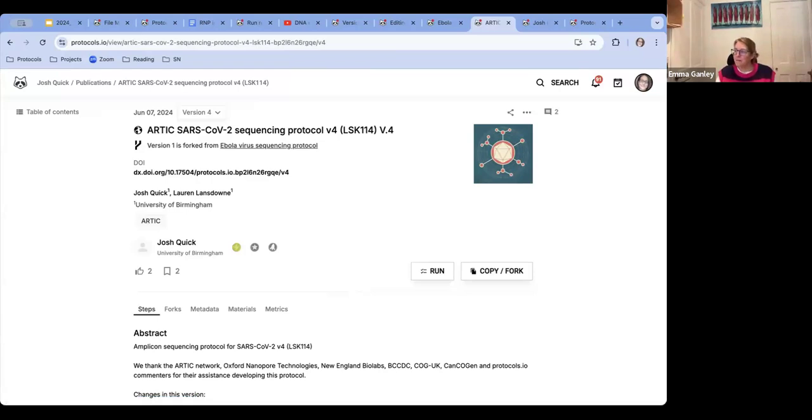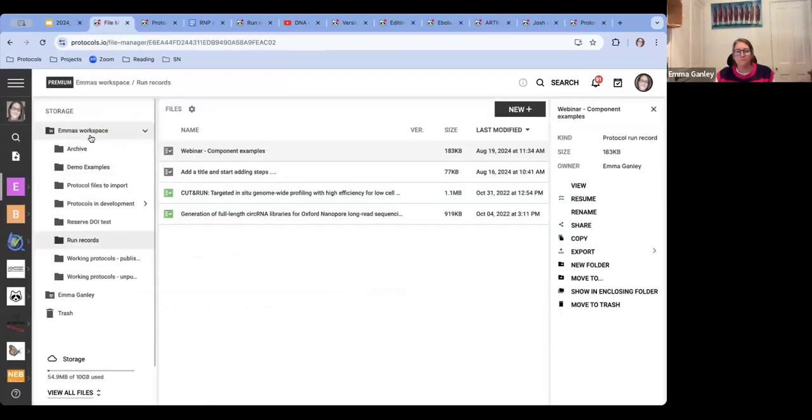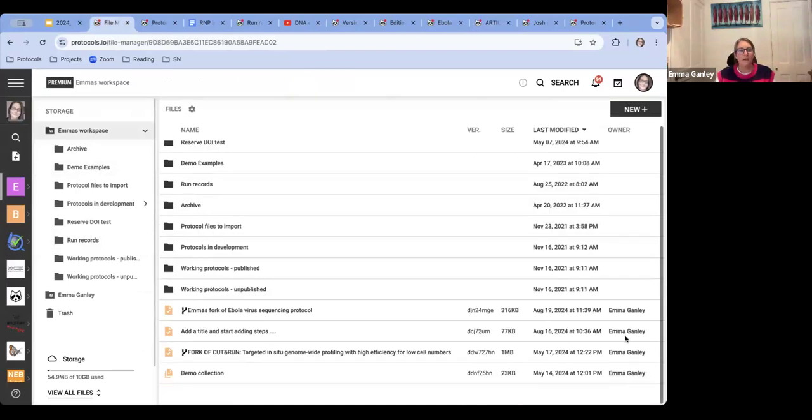All right, I'm just going to have a quick look. Other questions. How does protocols.io handle the original template created by the lab manager and instances created by other users? Well, you would always know who owns a protocol. So if you're in the workspace, you can see who the user is that's created any protocol file. So you'd always know whose it was. I'm not sure I know exactly what you mean by handle the original template. It would be then whatever it is.